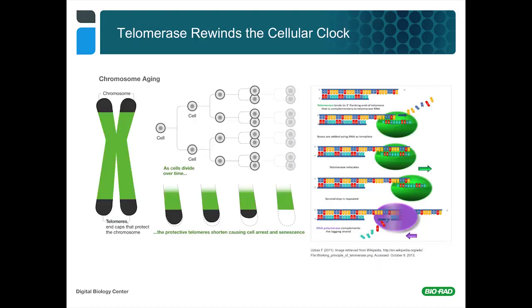And the last point is to say that it's also enabled us to look at some instances in the case of telomerase activity where we can actually measure the activity of the enzyme on a DNA substrate that is very repetitive and is not readily amenable to design of TaqMan probes.